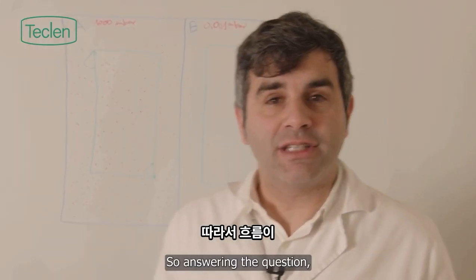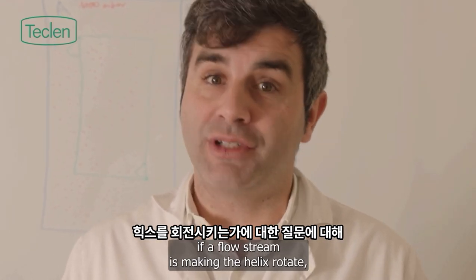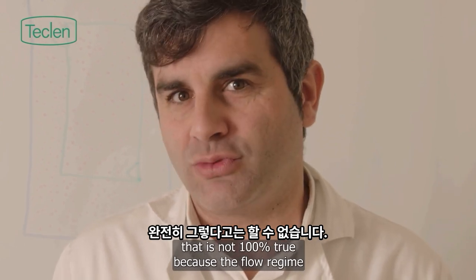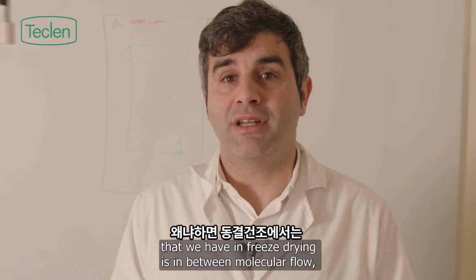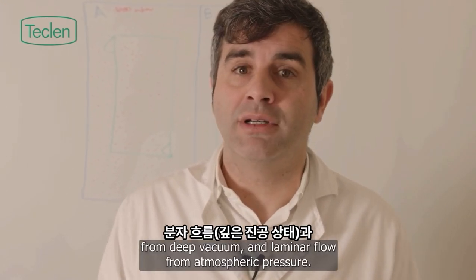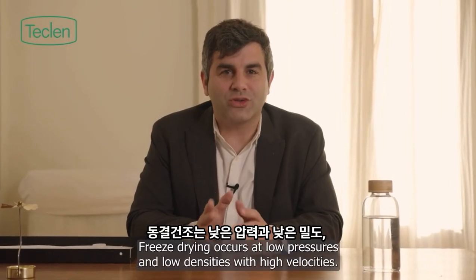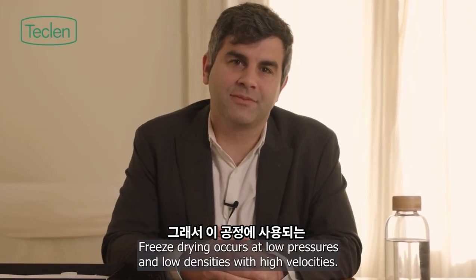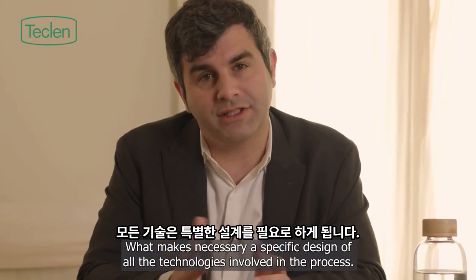So, answering the question, if a flow stream is making the helix rotate, we need to say that it's not 100% true, because the flow regime that we have in freeze drying is in between molecular flow from deep vacuum and laminar flow from atmospheric pressure. Freeze drying occurs at low pressures and low densities with high velocities, which makes necessary a specific design of all the technologies involved in the process.